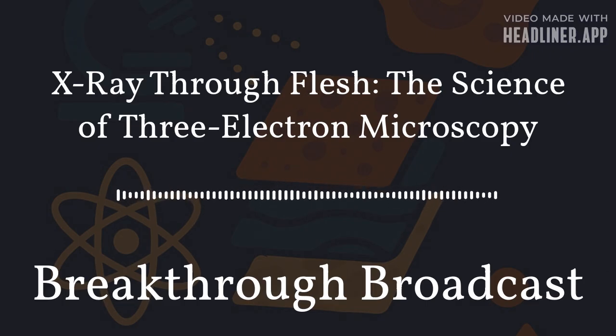Secondary electrons are those that originate from the surface. They're low-energy particles released when the incoming beam knocks outer electrons loose from atoms in the sample. Because they escape from only the top few nanometers of your sample, they highlight extremely fine details on the surface, like textures, ridges, folds, and the contours of membranes. Secondary electrons are the reason scanning electron microscopes, or SEMs, are known for their crisp, sculpted appearance.